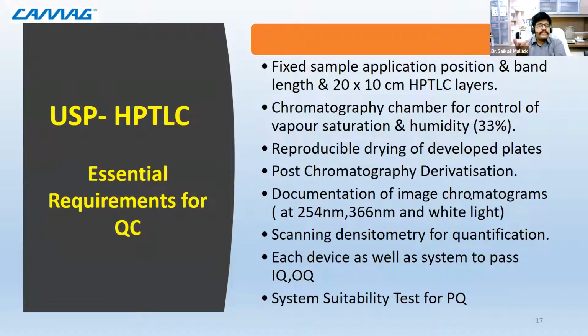And then finally, the humidity control, which states that about 33% humidity control should be established. So you should have a well-controlled environment. Now, there may be a chance that initially you may do an experiment in an uncontrolled environment, but when the final stage of the experiment is there, do adhere to these parameters, which will give you reproducible results each and every time when you want to do an analysis.